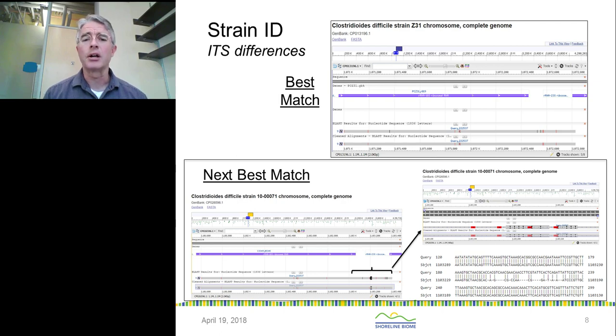And you can see that gray bar along the bottom of that box actually is the sequencing read, and it covers the full 16S gene and crosses through into the 23S gene and covers that spacer region in between.